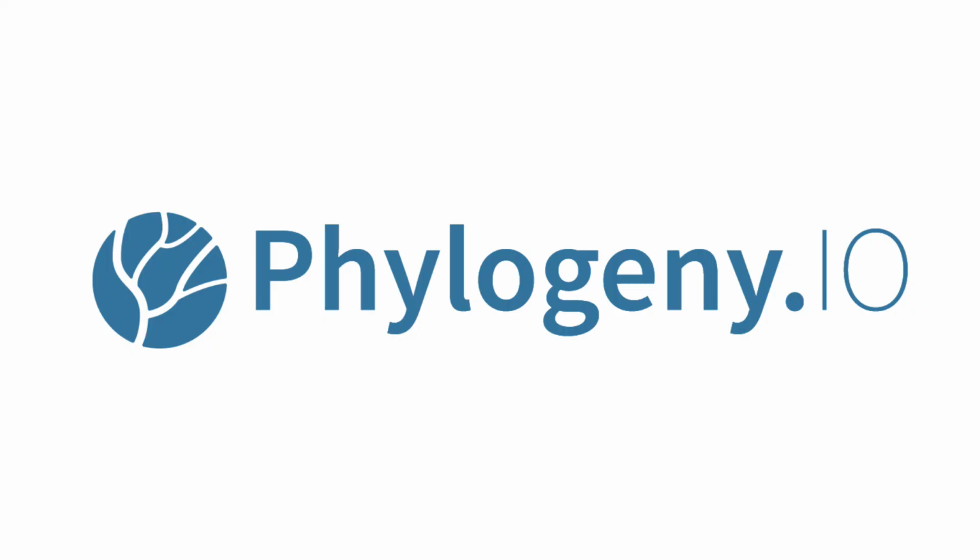I really hope you find this site useful. There is a contact us link above the website in case you report any bugs, which are still likely to be found, or if you have suggestions for improvements. This project is open source, and you can find a GitHub repository with the code in case you want to tinker with it or expand it further.